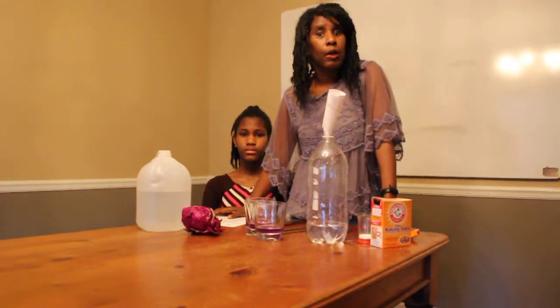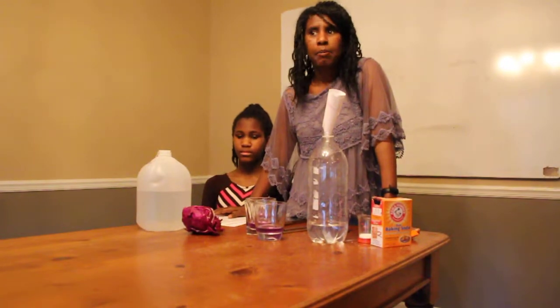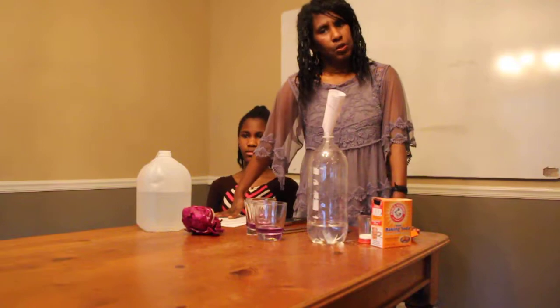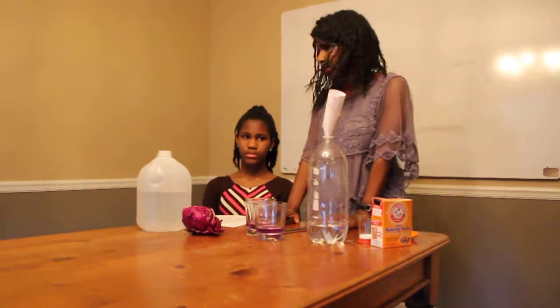So I hope you had a good weekend, and we're going to continue where we left off last week. We started experiment 12.2, and you guys got the gist of the experiment. However, it didn't work because my cabbage water had already had a chemical reaction to it, so we couldn't see any change. And I had divided you into two teams, boys and girls, and we were going to repeat the experiment today, but we're doing a Zoom class. So let's just do it together. You can watch Skylar and I do the experiment.